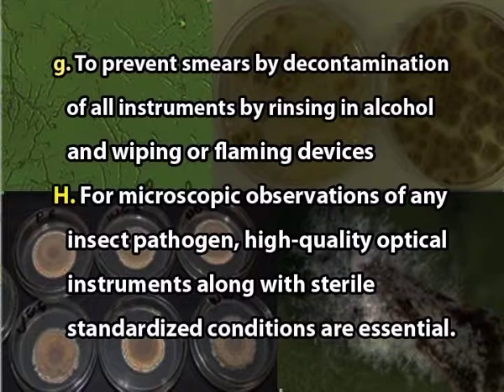For microscopic observation of an insect pathogen, high quality optical instruments along with sterile standardized conditions are essential.